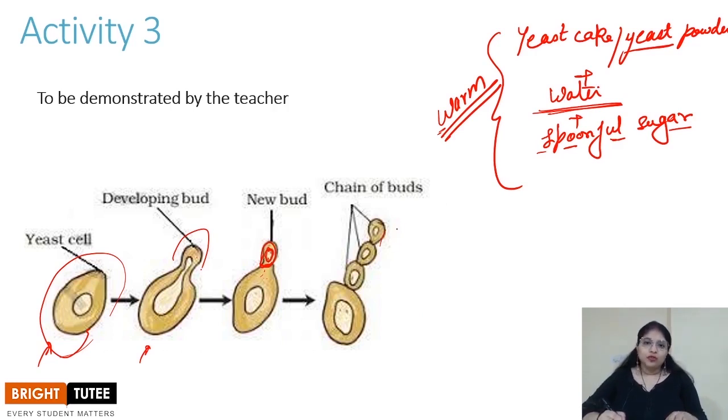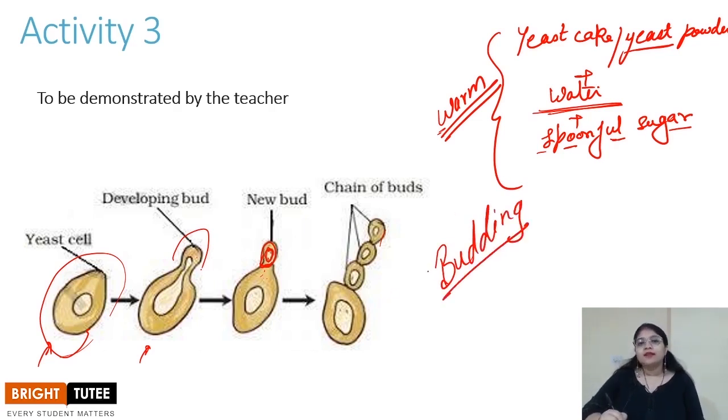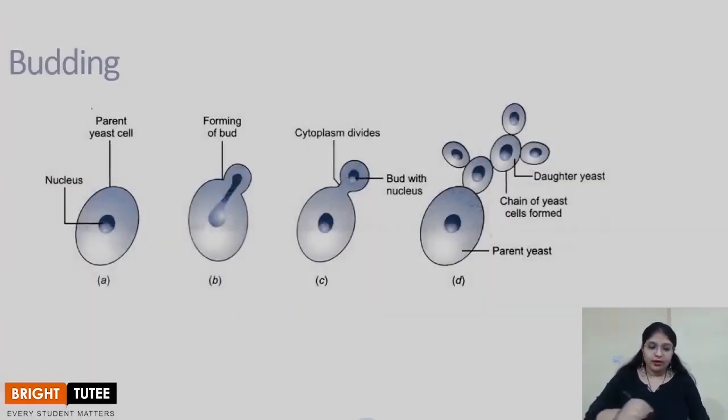This is something which you will observe. Please draw the diagram of whatever type of yeast you are observing in that drop of liquid. What you observed is the process known as budding, and this is the process that this unicellular organism, yeast, uses to reproduce. Let's understand it in a little more detailed way.